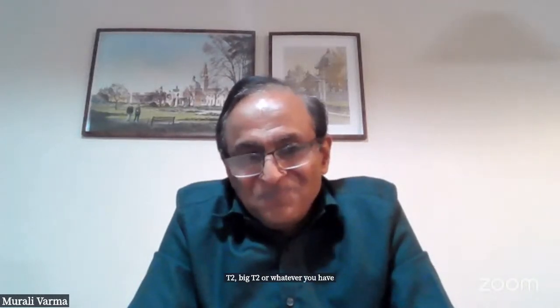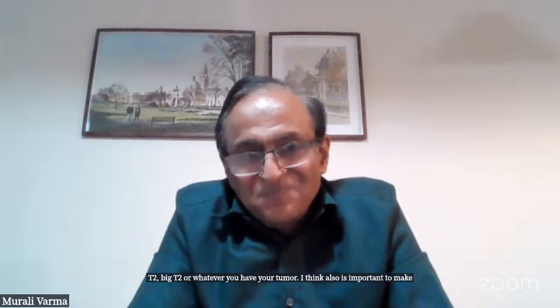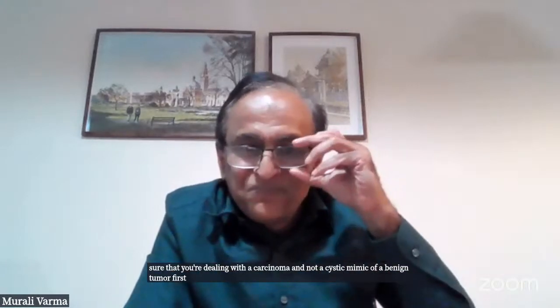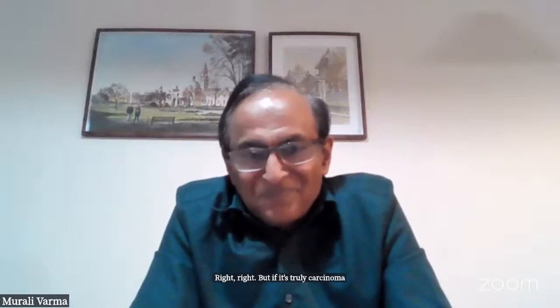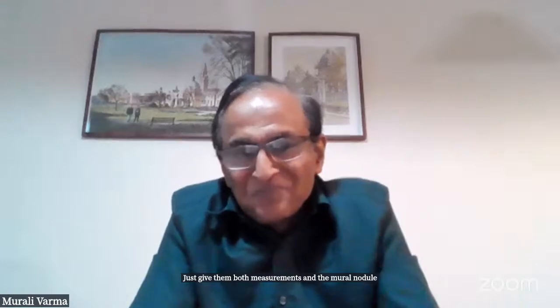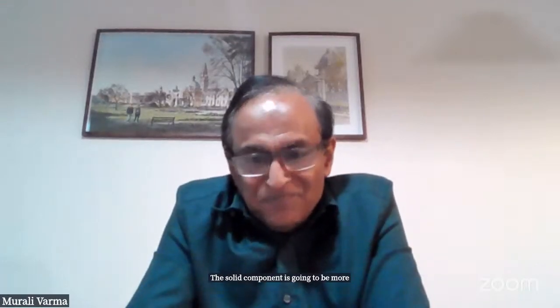I think it's also important to make sure that you're dealing with a carcinoma and not a cystic mimic of a benign tumor first, but assuming that it's right. If it's truly carcinoma, just give them both measurements, and the mural nodule, the solid component, is going to be more likely to be what's clinically relevant.